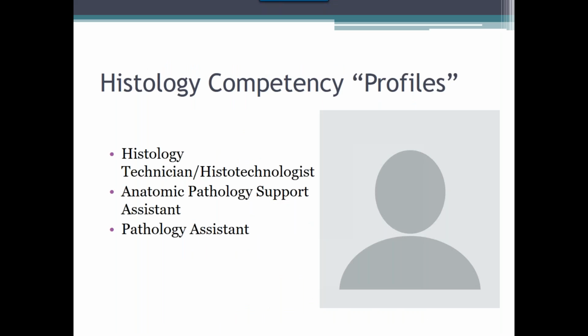So this process of creating competency assessments should get repeated for every employee role in your department. So in the end, you should have a handful of predetermined competency assessments based on the roles you have within your department. These competency assessments then get assigned to the employees based on their role.